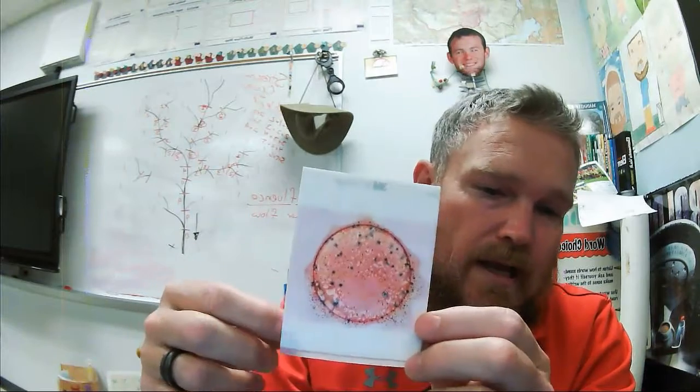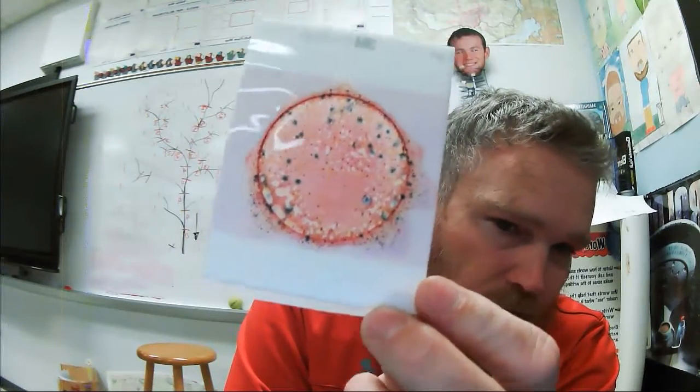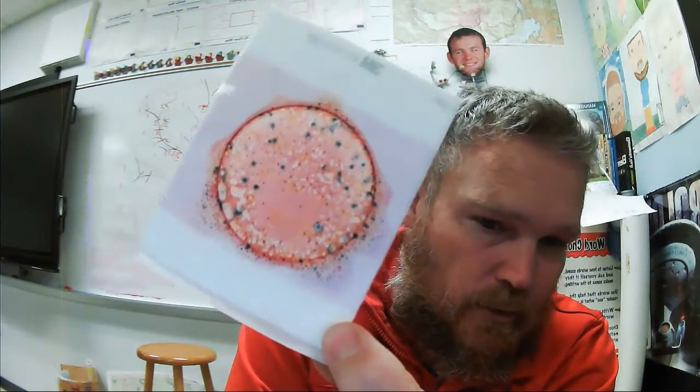So the other test that they were doing while that's going on, so that you don't lose a lot of days, when they tested those samples by putting some in a vial, they also put some on a count plate, which initially will look like this, and the little red stuff inside of that is nutrient agar, which is just food for bacteria. And if after 24 hours of incubation, these are bacterial colonies, or fecal coliforms, or coliforms really.